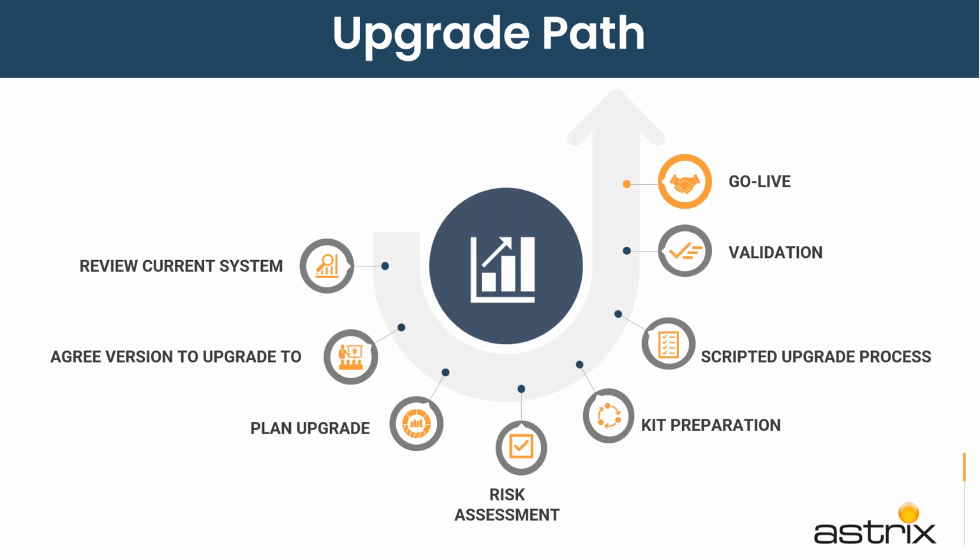That's where you have to decide: is it a 6 months plan, is it a 3 months plan, how long do you need, and what are the different stages? When is the cutoff happening, when is the actual validation, when is the actual go-live happening, how long is the hypercare period planned. All these things need to be done in this planning phase.